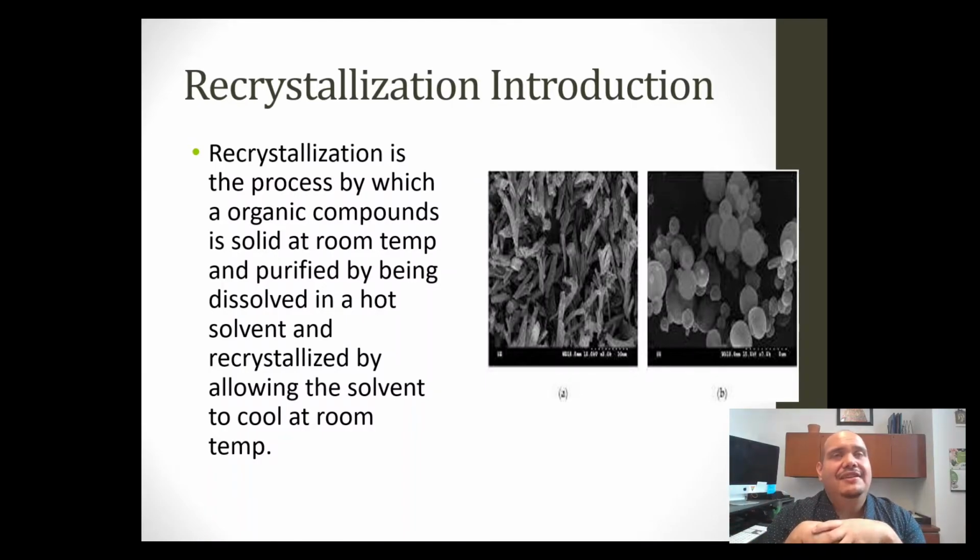You take 36% copper sulfate, you dissolve it in water, and hang a little string in the middle with a little weight. You leave it in there for maybe a month or so. You come back and there's this beautiful blue crystal of copper sulfate that has built a scaffold around that string. And that's really cool. But that is crystallization. What we are doing is recrystallization. And that is the difference in these terminologies.